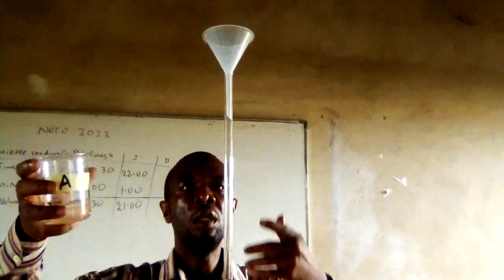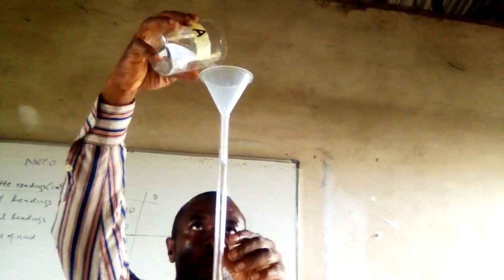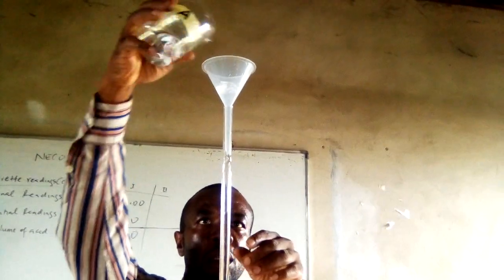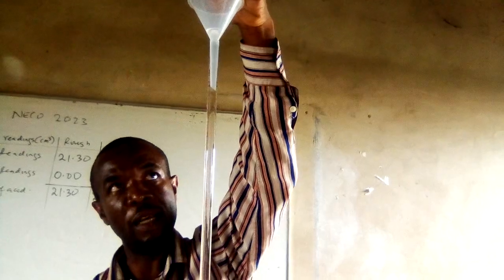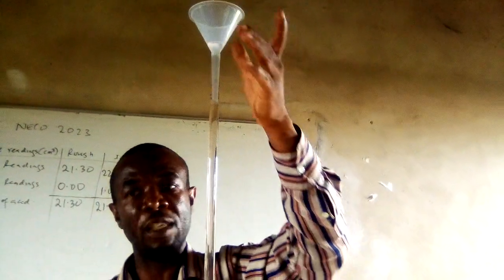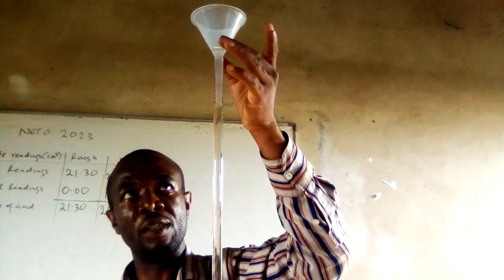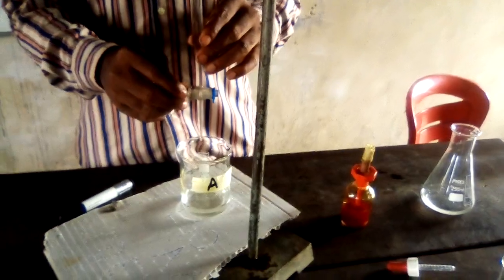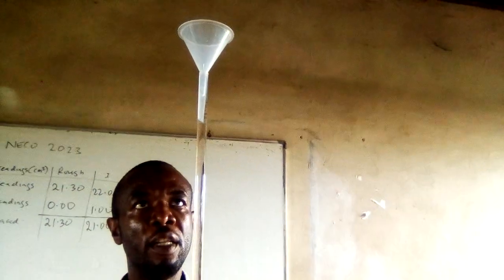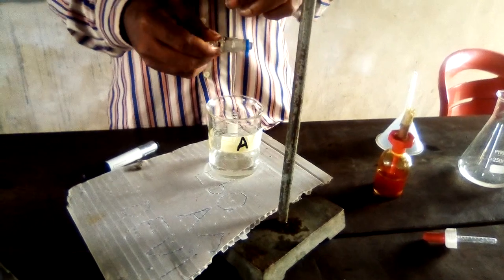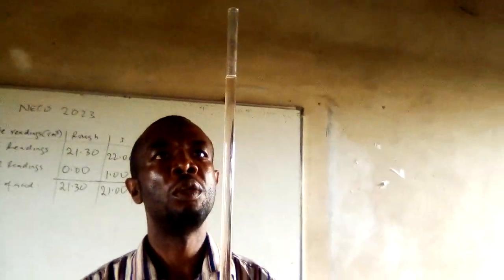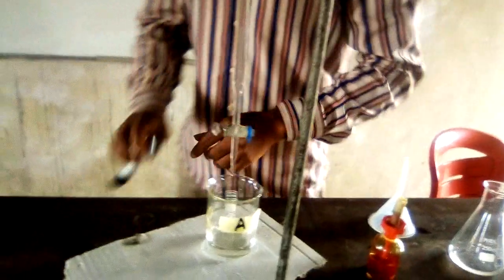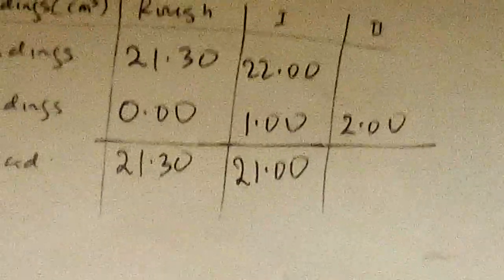For the second accurate titration, we add more acid to the burette. There's some acid left in the funnel — we leave the funnel in place and reduce the level carefully until the funnel is clear of acid. We then set the initial reading to 2.00 cm³.